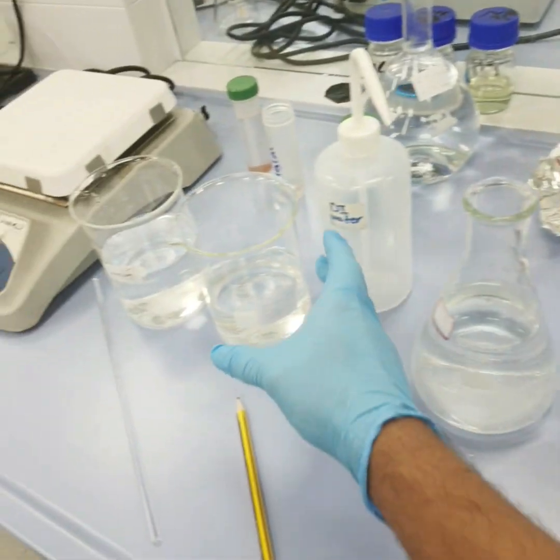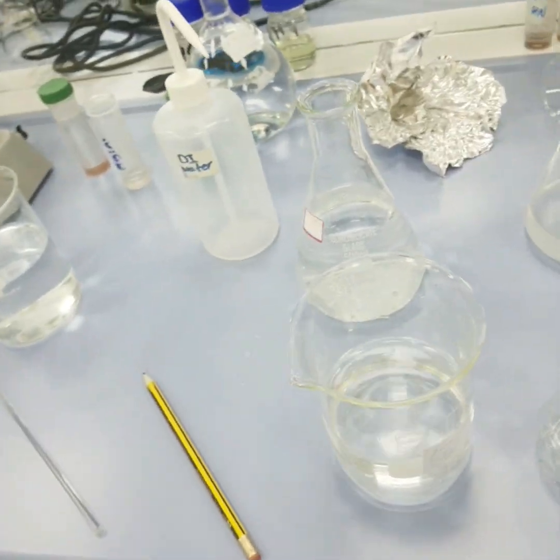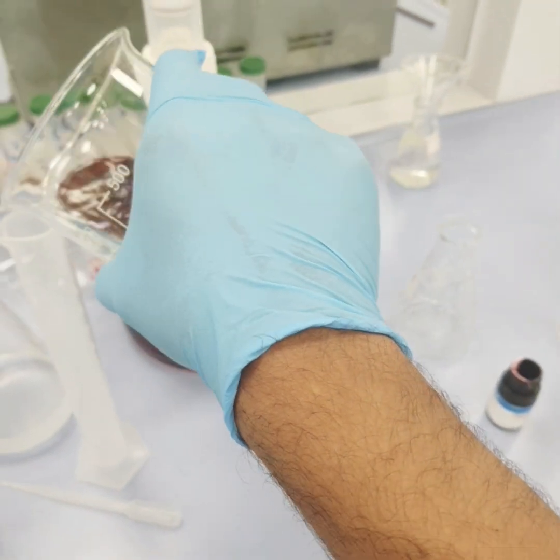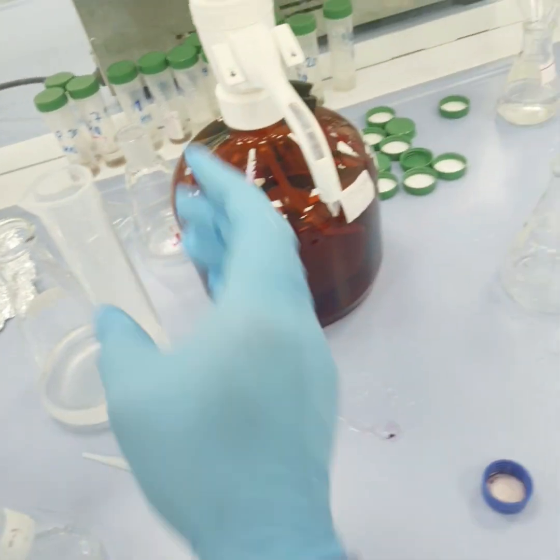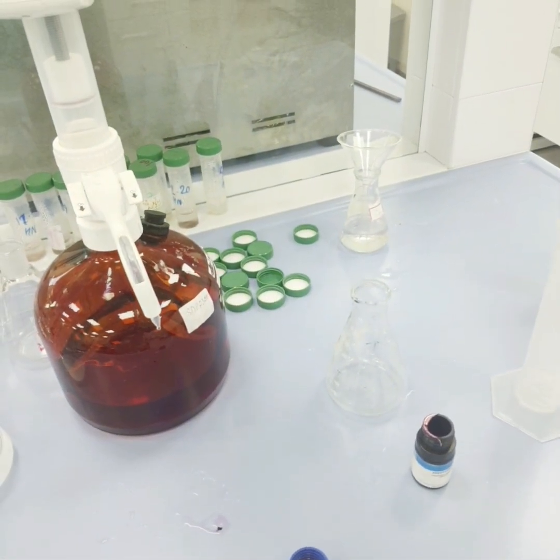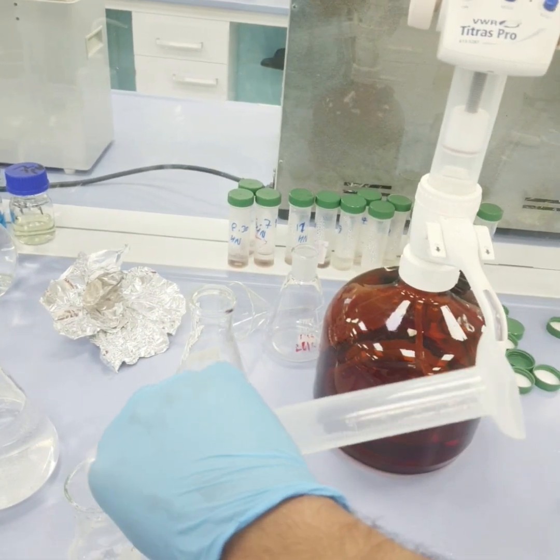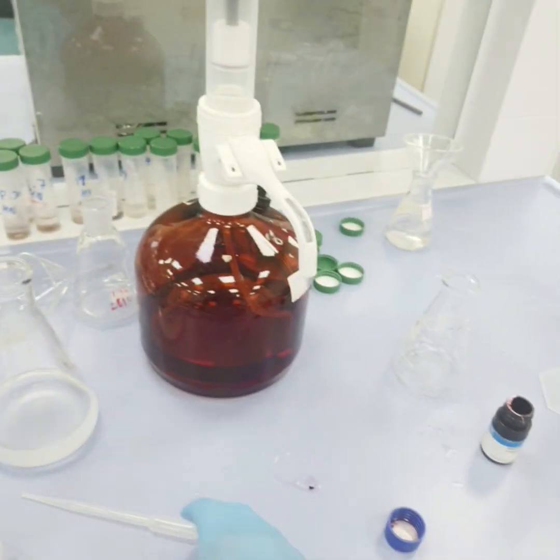So here we are taking one of the samples. This is my hard water sample. We should also check the pH. So pH is around 7. Now I am taking around 50 ml of the water sample, and here I am trying to find out the total hardness. We'll also find out the permanent as well as the temporary hardness.